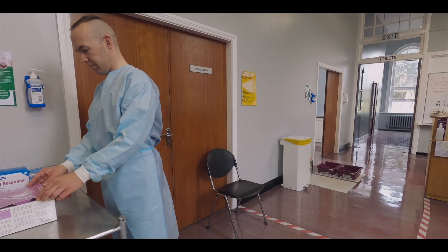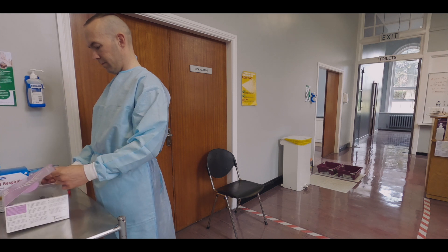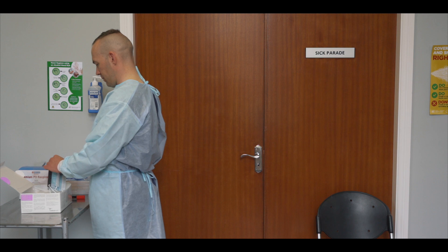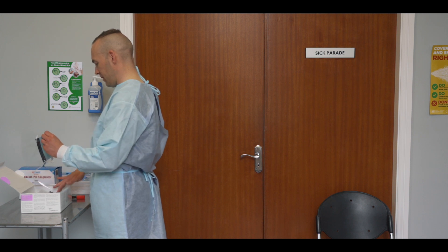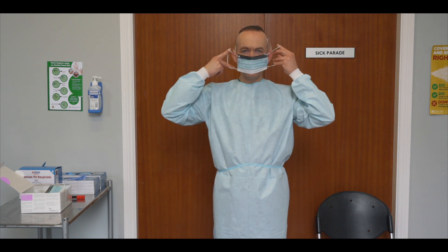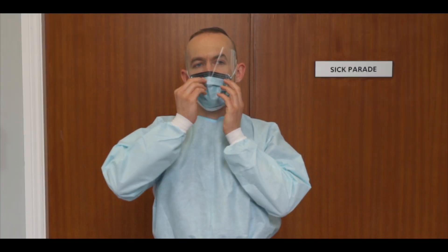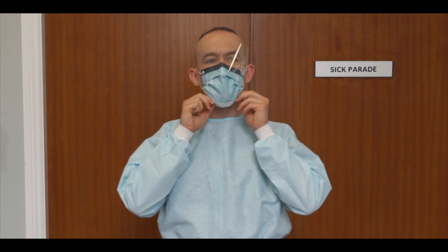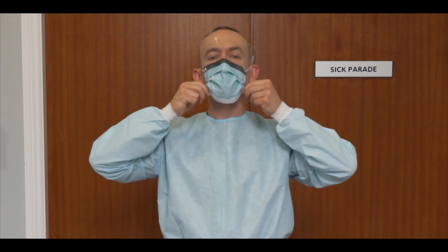Select an appropriate face mask. In this case, we are using a Type 2 fluid resistant mask with integrated visor and ear loops. Place the ear loops behind the ears. Use the upper wire band to create a firm seal along the bridge of the nose. Pull the mask below the chin and ensure there are no creases.